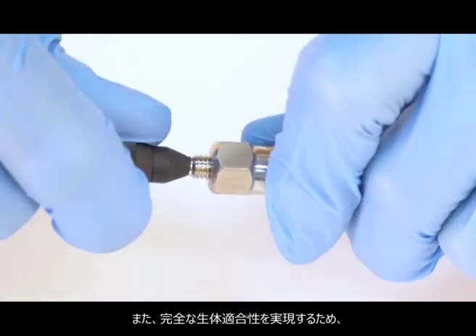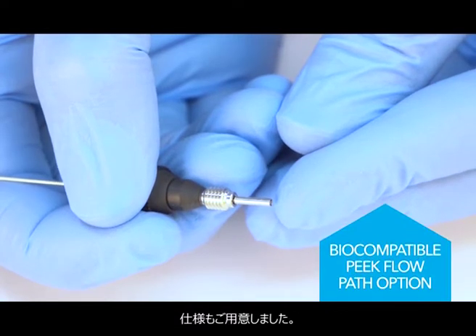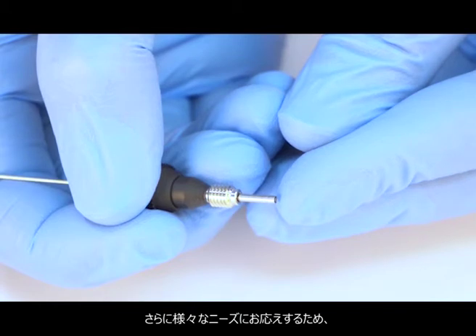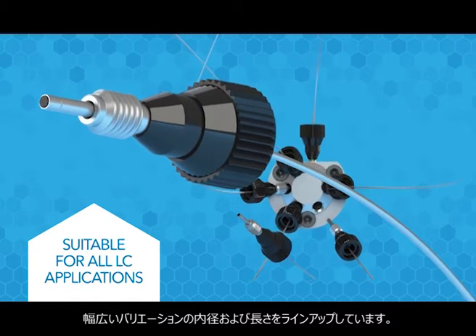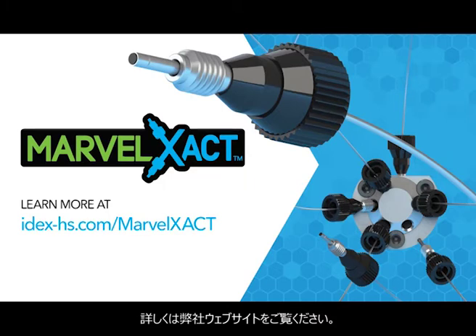For true bio-compatibility, Marvel Exact features a PEEK-lined stainless steel option which provides an all-PEEK flow path. And to meet the needs of a variety of LC applications, Marvel Exact comes in a broad range of inner diameters and lengths. Ensure a perfect connection every time with Marvel Exact. Learn more at idex-hs.com/Marvel-Exact.